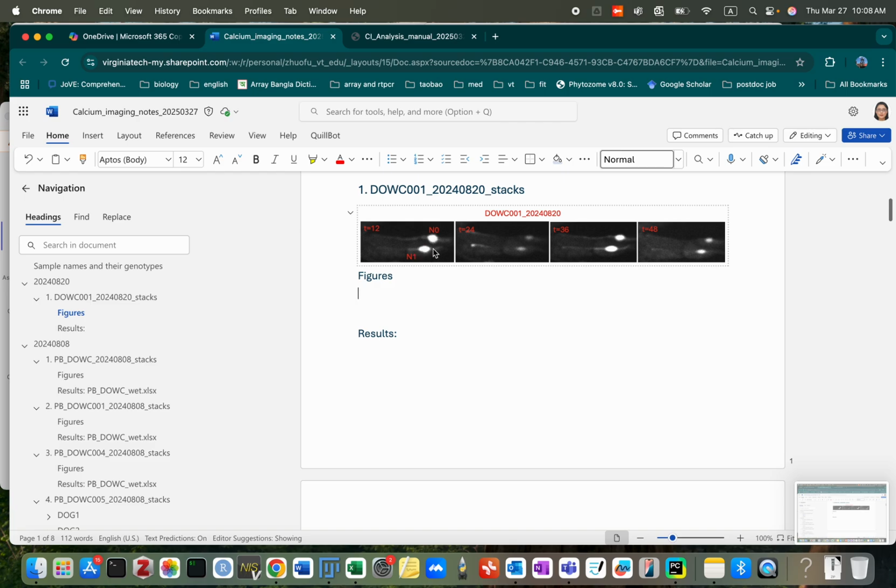This is the cell body, and then you see the dendrite, and you have a little dot, that's the dendrite bulb. We only analyze the cell bodies. The picture is from different time points. Start with 12, and the temperature starts cooling. With cooling, you see the cells' fluorescence decrease, and then at 24 we start warming. So you see the cell response getting brighter, and then another cooling.